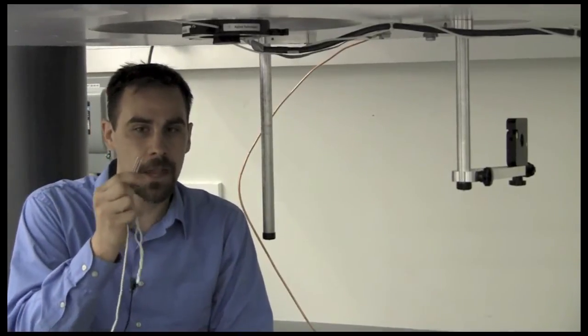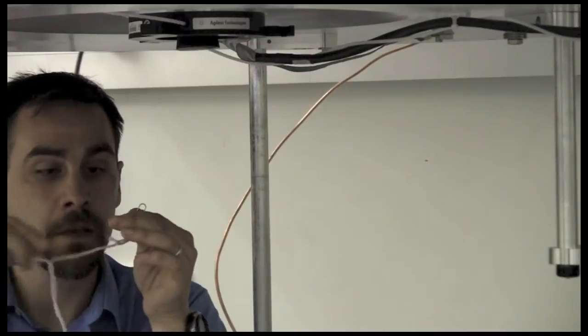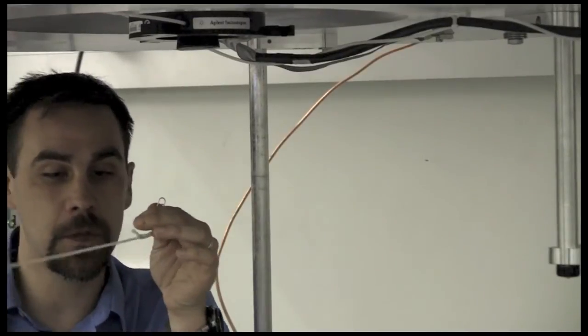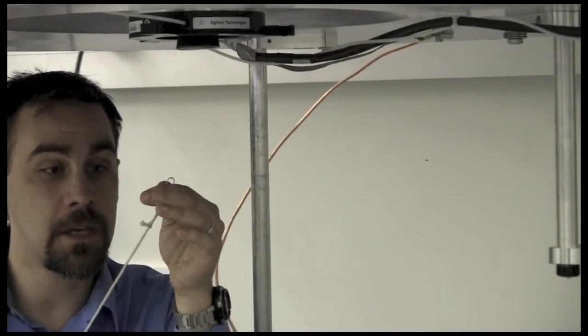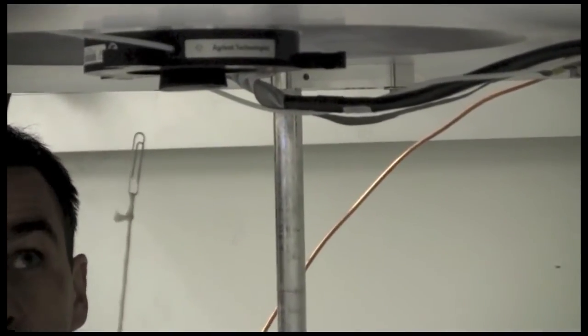So I have here a standard paper clip, and because I'm in a strong magnetic field, it wants to get pulled into the bore of the magnet up there. So I've attached the paper clip to a string, and you can see that the paper clip is very powerfully attracted into the bore of the magnet.